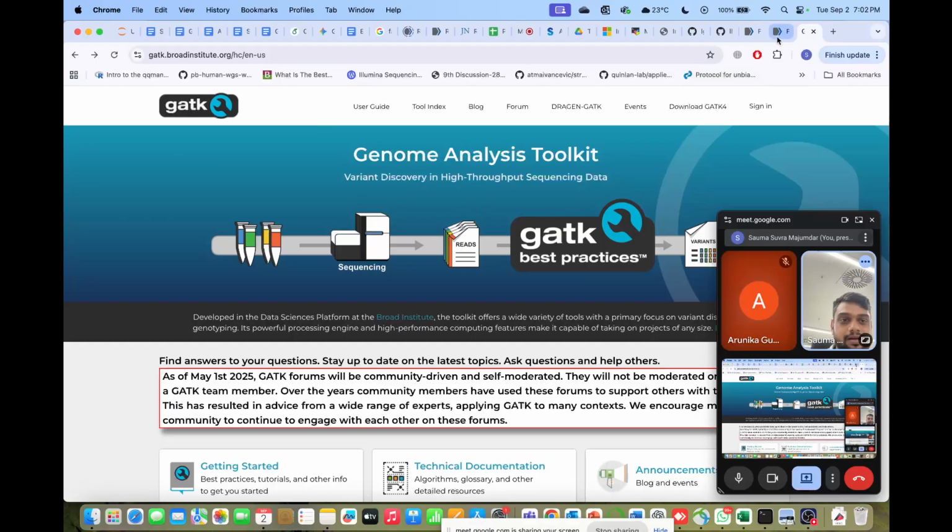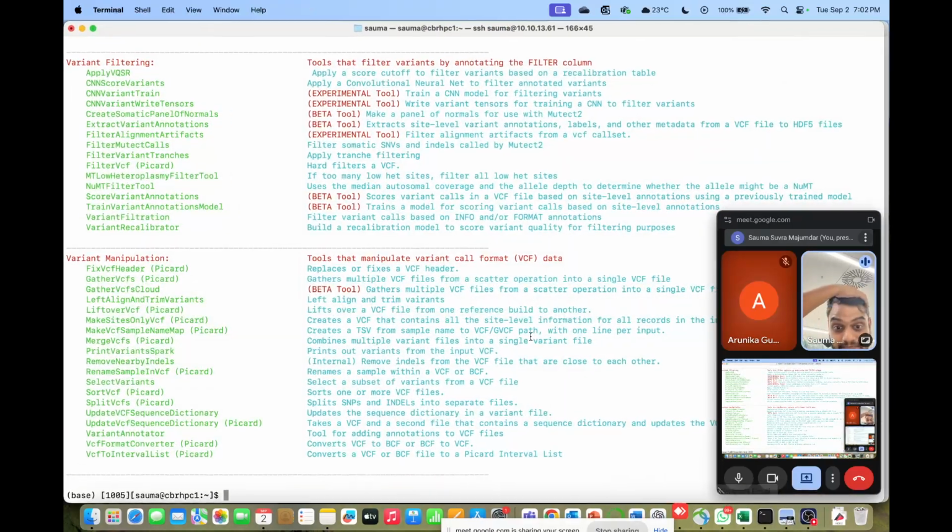So as I was saying, if you want to run this in the command line, you can use the commands as I showed you. For example, for BWA-MEM, similarly for GATK, you can use these command lines in Linux environments and run your samples for data analysis, right?